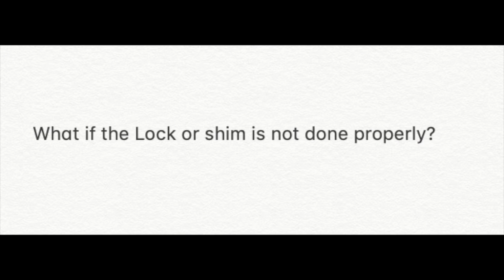There are a few things that can happen if you don't lock or shim the instrument properly. One thing is that you just won't get a spectra. There will be an error and you have to restart the experiment. The second, the spectra will have a lot of noise if it's not set at the right levels, and that'll be hard to read. You might not get the right integration, and it'll be hard to know what you really have. The third is you will get a spectra, but the chemical shifts can be skewed if you didn't lock it correctly or you didn't lock it with the correct deuterated solvent. And lastly is you can damage the machine. You definitely want to lock and shim properly so you don't break anything within the instrument.